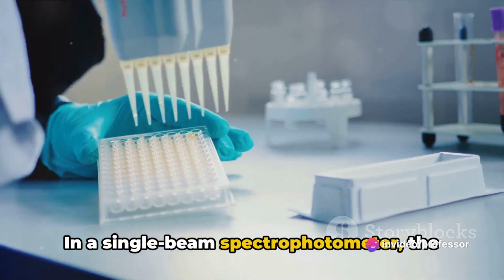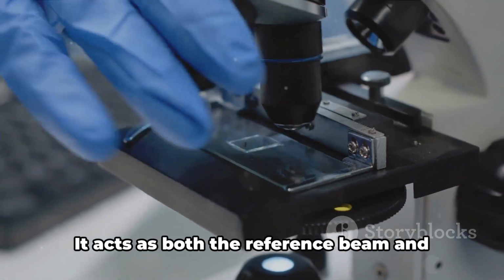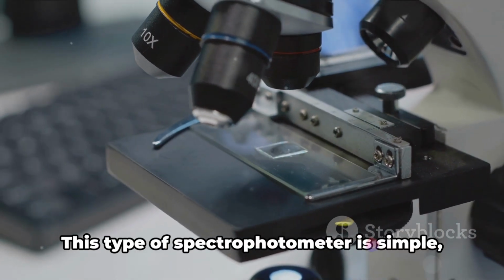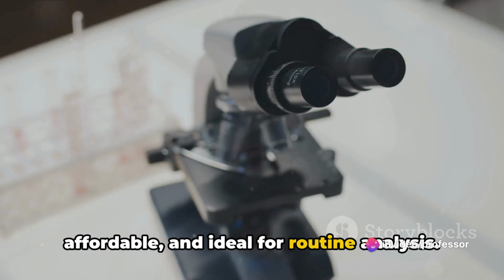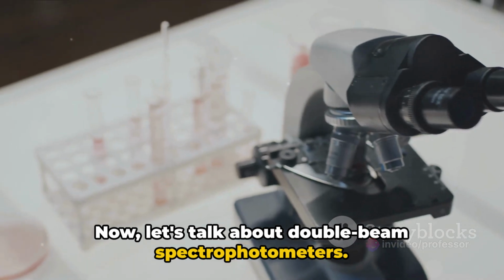In a single-beam spectrophotometer, the same beam of light serves two purposes. It acts as both the reference beam and the sample beam. This type of spectrophotometer is simple, affordable, and ideal for routine analysis. Now let's talk about double-beam spectrophotometers.